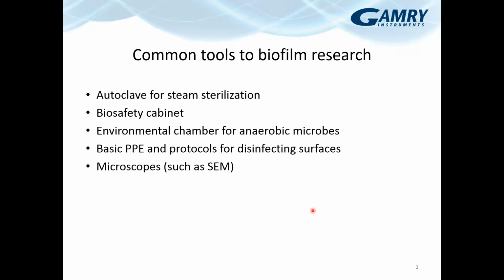I put this list here because this is the kind of thing that most biofilm researchers have access to. When you go to grow your biofilms, you have to operate in a sterile environment, and you have to make sure that what's growing as a biofilm in your system is the culture or the strain that you expect. You don't want contamination essentially.